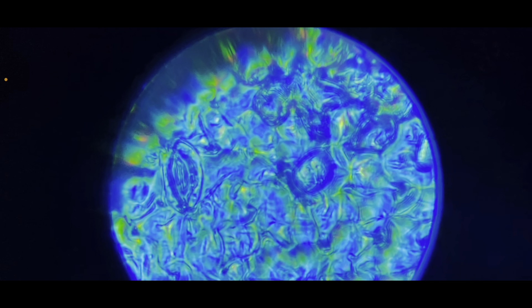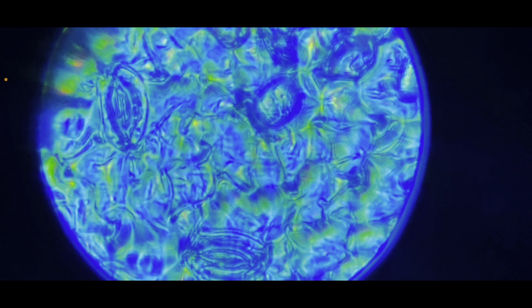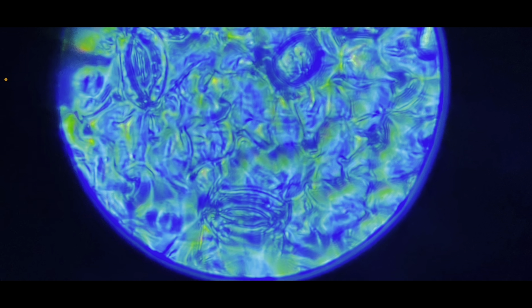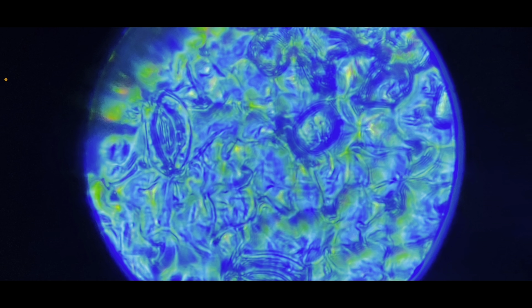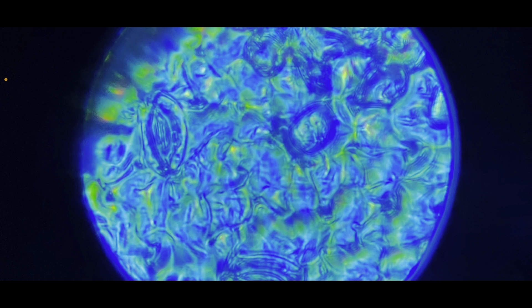Okay guys, so this is what I see with 480x magnification. This is truly something we couldn't see before — you can see the details of each cell more clearly. Maybe these are spindle fibers; I'm not sure, they just look like a mess, but a beautiful mess.